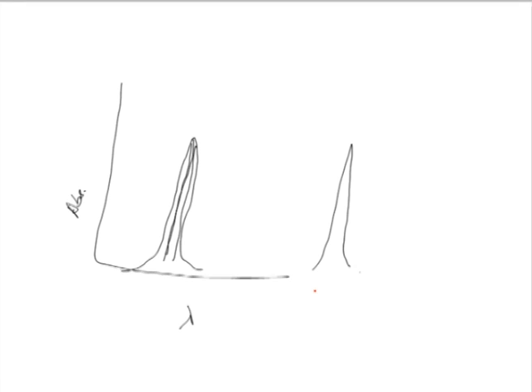That has to be understood. As we were talking about Beer's law, if the concentration is too high, then it will be violated. Then the measurement has to be done at the proper wavelength, so that Beer's law holds, and a lot of other precautions have to be taken, so that this particular analysis can be done without any problems or spurious results.